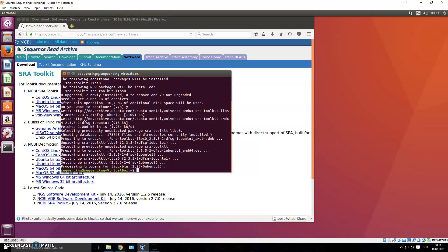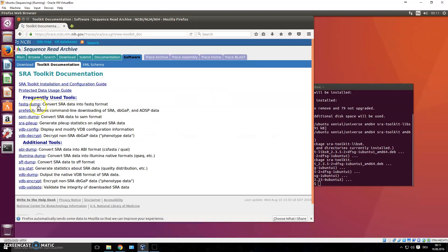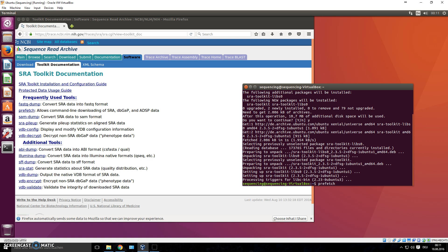It saves a lot of time. Now you've installed the whole toolkit. You can look at the toolkit documentation, which lists frequently used tools: `fastq-dump` converts SRA data into FASTQ format, and `prefetch` allows command-line downloading of SRA data. All you need is the SRA ID of a file and you can type `prefetch` — I pressed Tab and it auto-completed because I've installed SRA Tools. Now I need to find a repository and some FASTQ files to download.